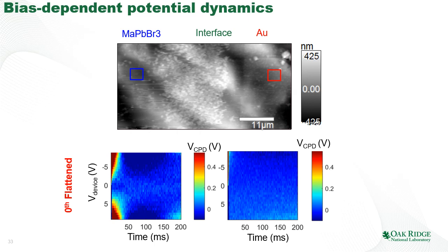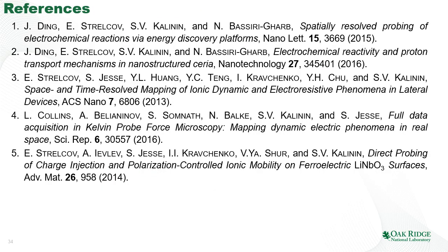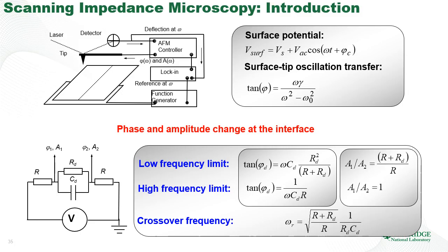At this point, I will just say that this is possible, and I will leave the details for a different presentation. The additional information about the TRKPFM is available in the set of papers by Evgeny Strelkov and Liam Collins. They're available here. And this is one of the techniques that is available at the Center for Nanophase Materials Science and can be used as a part of the proposals.